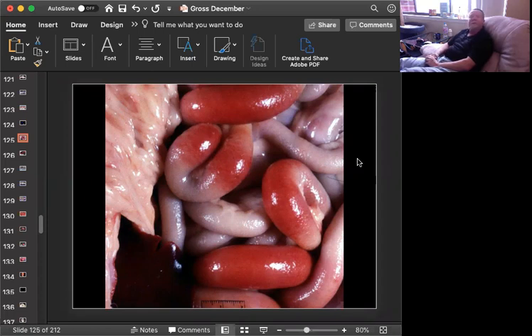Okay, time's up. We see multifocal areas of hemorrhage, and we've said so many times before, whenever you see hemorrhage, I want you to think about necrosis. The necrosis is probably not transmural, the hemorrhage and congestion is. But all these red areas probably represent an area of necrotizing enteritis in this dog. We've talked about Williams' rule of red guts number 1, and that is if it's a dog or a cat, you want to think parvovirus. In this case, it's canine parvovirus type 2.